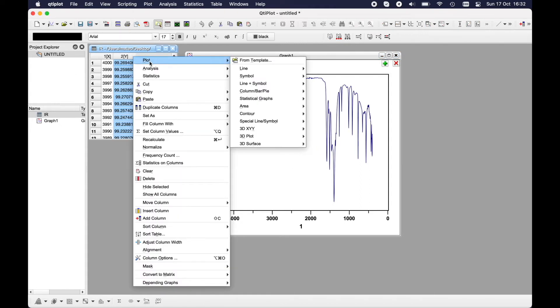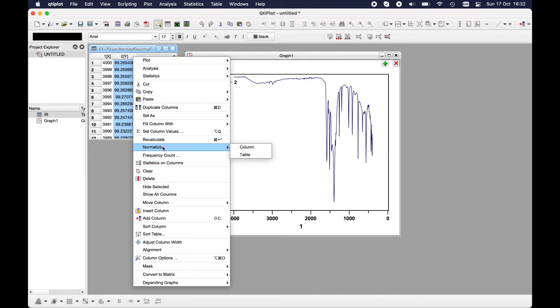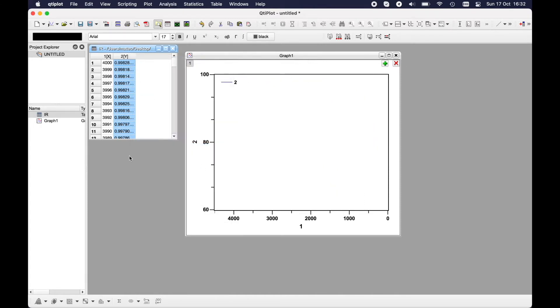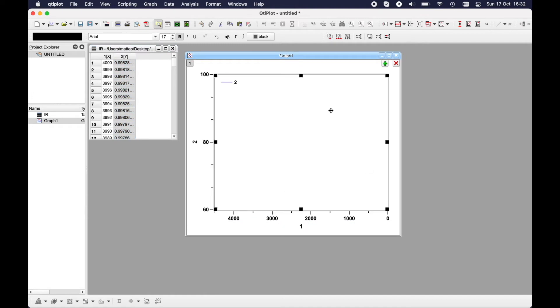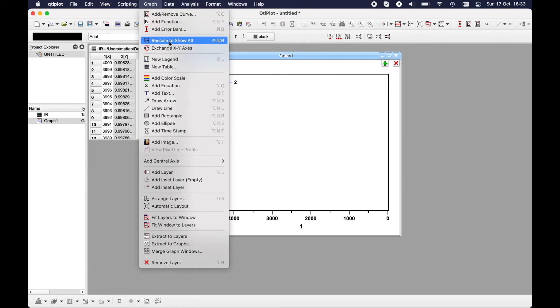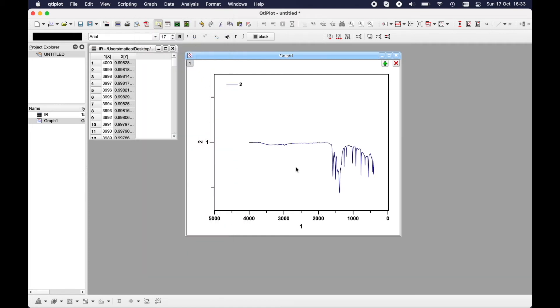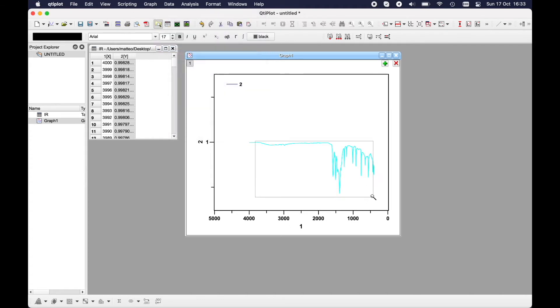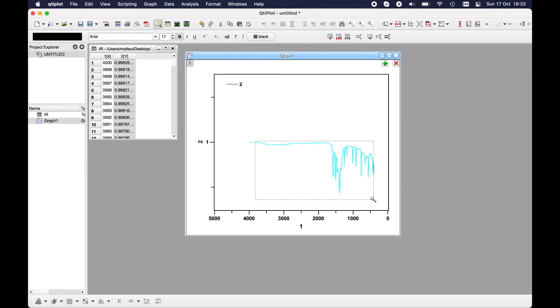You can do the same with the left axis. Let's say you would like to normalize this, so the thing you have to do is to go here, normalize column. It will normalize from zero to one. If you want to resize the whole window, just go here on Graph and Rescale to Show All, or with this combination, and you will rescale everything. But you can also zoom in as you please. For example, I would like to zoom in this zone, and here we have this spectrum.